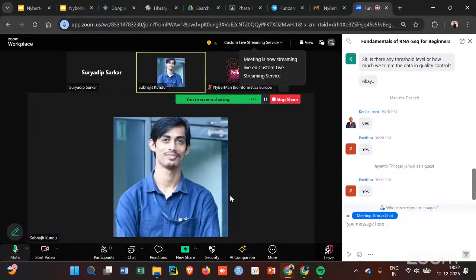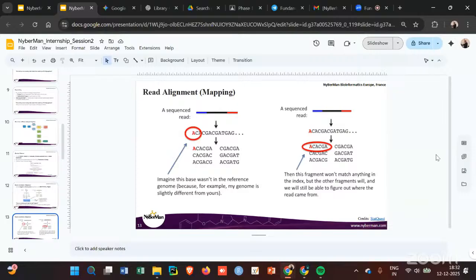So as I said, if you had taken the entire read, you would probably end up discarding it. But since you broke it down into fragments, now you know that it might have been actually a sequencing error. So you still take that read further for the downstream analysis, because it is just a one base error, right? And these tools and frameworks which are created are made with the assumption that your sequencing machine will invariably make some mistakes.